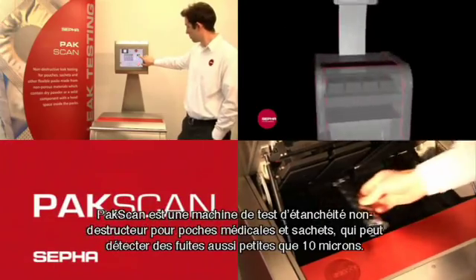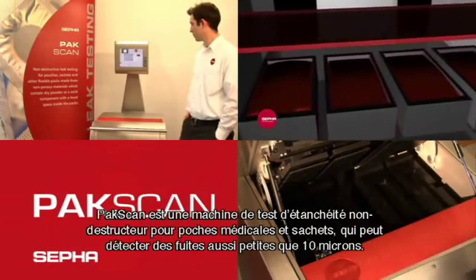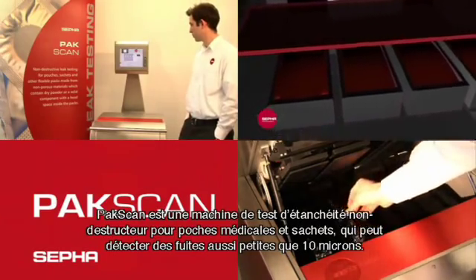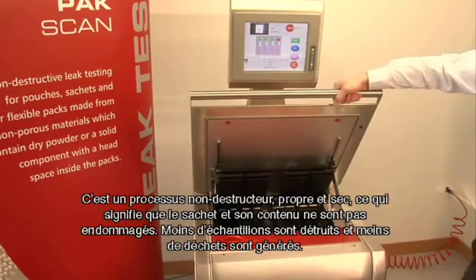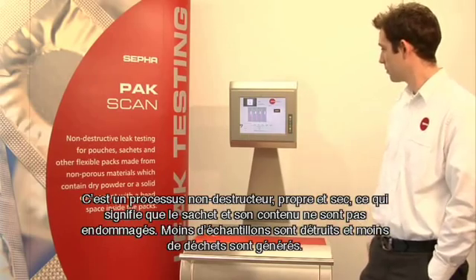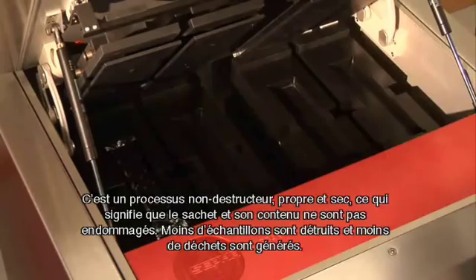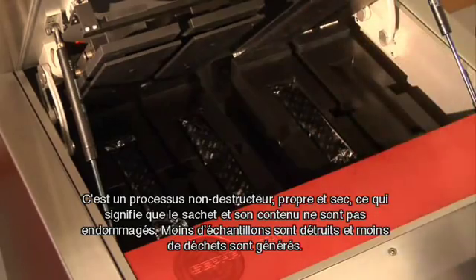PackScan is a non-destructive leak tester for pouches and sachets that can detect leaks as small as 10 microns. It is a non-destructive clean dry process, which means that the sachet and its contents are not damaged. Fewer samples are destroyed and less waste is generated.